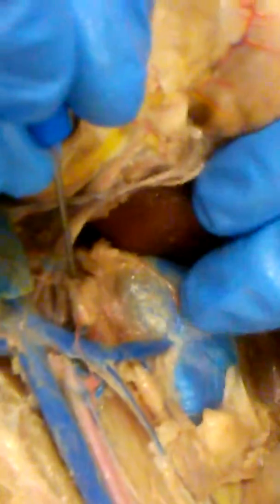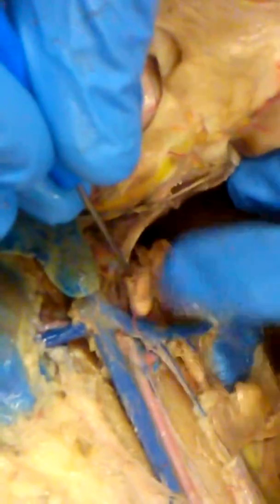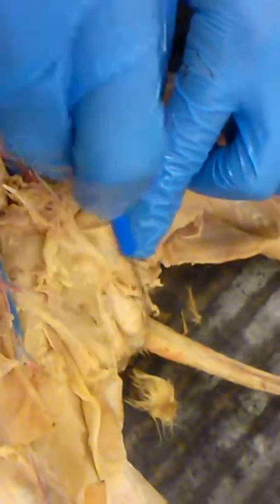Then you have the adrenal glands. On humans, they sit right on top of our kidneys, and they're so tiny on here. That's the adrenal gland. In a cat, here's your kidney, and then it sits up a little bit. You don't need to know kidney. Yeah, adrenal gland. It's so adorable. It looks like a little peanut. And then of course the testes. We know where those are. And then we'll know the ovaries, and that's the thymus.